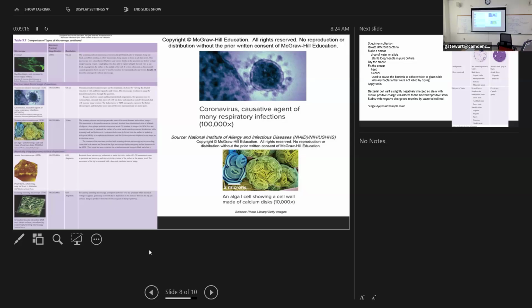As you might imagine, there's a screen, and like I said, it's usually attached to a computer, and so then you can capture the images. In olden times, we had a physical camera attached to them, and we had to take rolls of slide film and then develop the negatives, and then decide which ones showed the best of what we were trying to measure or identify that we would want to put in a research paper or on our poster. And then we would have to take them somewhere and say, can you make these 8x10 glossy photographs, right? Obviously a lot easier now, but no less expensive, right?